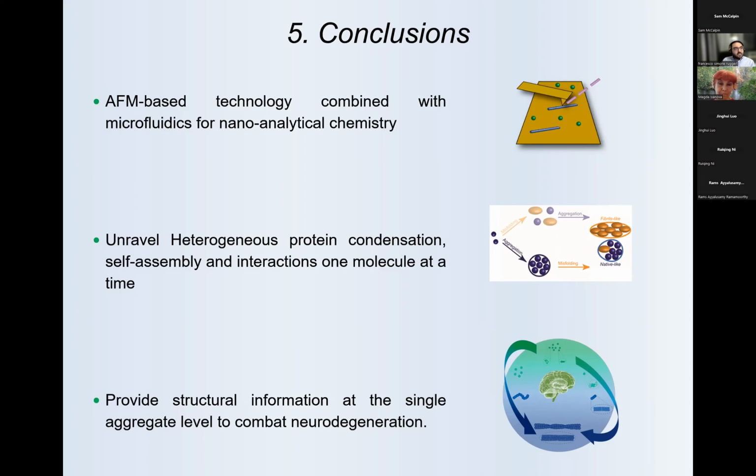Having a surface can always be good or bad, depending on the point of view. Sometimes amyloid formation occurs on surfaces, such as lipids. Often, when we want to probe the properties of the aggregates, we probe them on independent substrates. This means we take the same sample, deposit it on different surfaces, and measure the same property. And we are happy when this property doesn't change with the surface of deposition, because for us it's a good indication that it's an intrinsic property of the molecule.